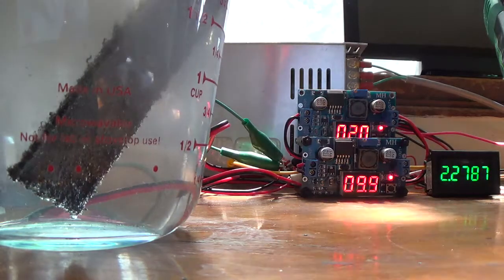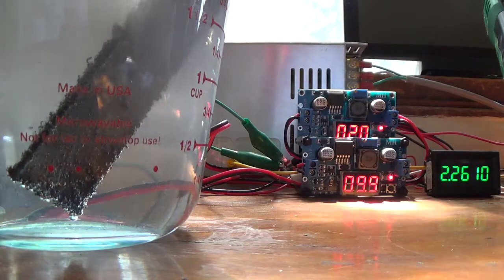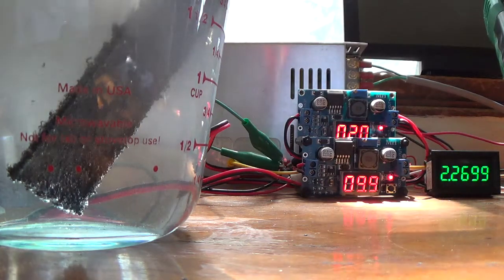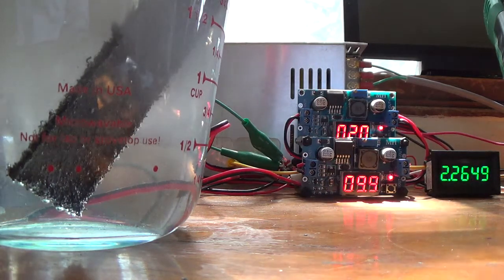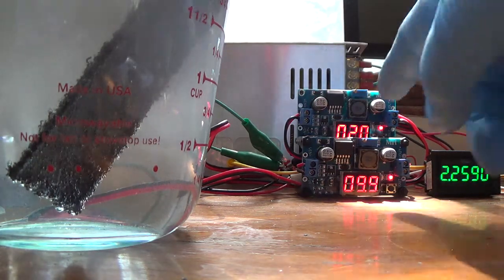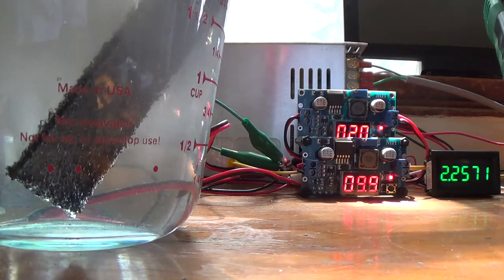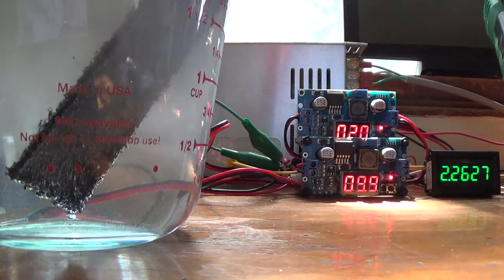We more precisely copied Robert Murray Smith's experiment in that we used a 0.5, to be clear, 0.5 or 1/2 molar solution of sodium sulfate and ran it at 2 volts using the upper power supply for a period of 2 minutes, followed by the 10 volt power supply at the bottom, and that has been running now for approximately 5 minutes.